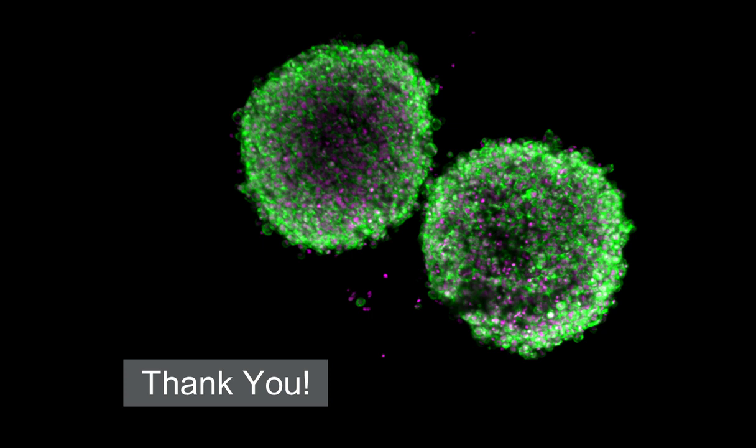Yeah, so good question. I think the points towards the end there were just general advice that apply here, where really we may need to experiment a little bit as you're transitioning to a three-dimensional model. I'd highly recommend the Nunclon Sphera plates as a way to get started making spheroids with your adherent cell line of choice.